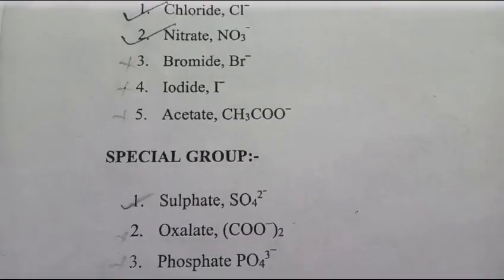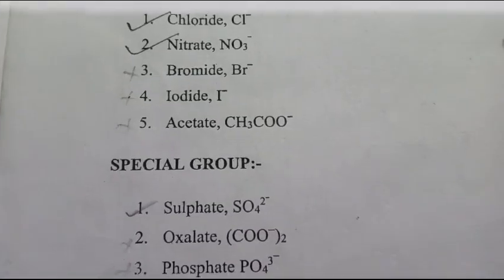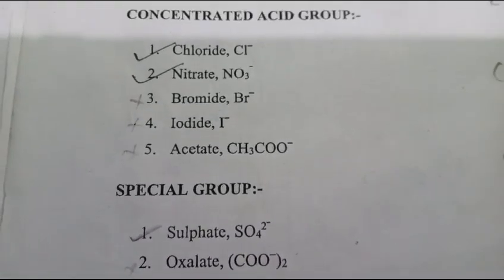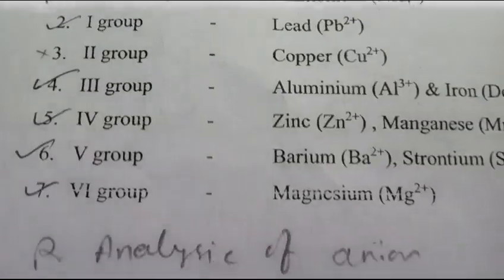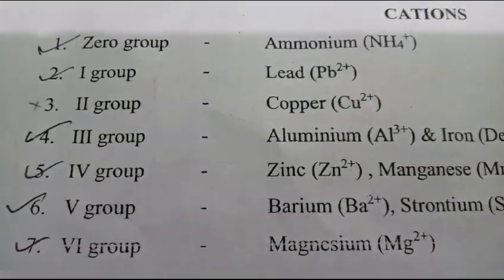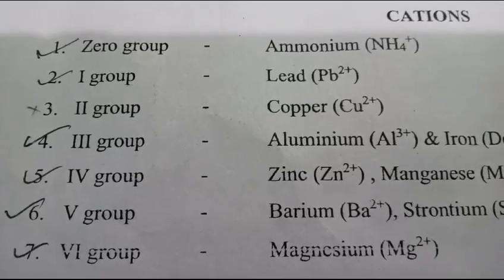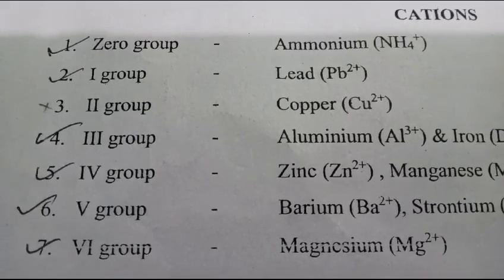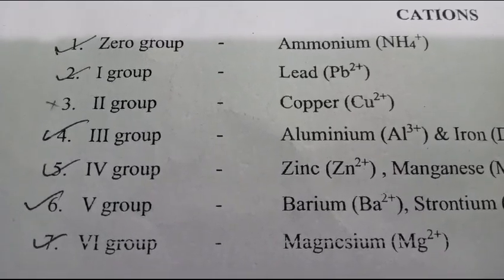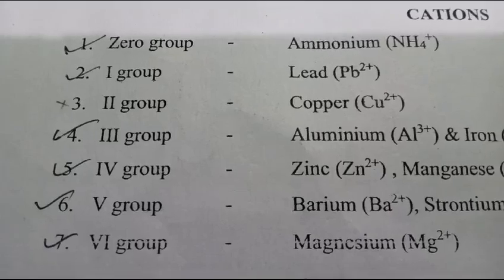Okay, I will explain that when you find magnesium, that means nitrate will be there as an anion, and magnesium will be the cation. I will explain you directly, but in the exam you have to do it, because you don't know which anion and cation is present, so do it properly, just find it one by one.